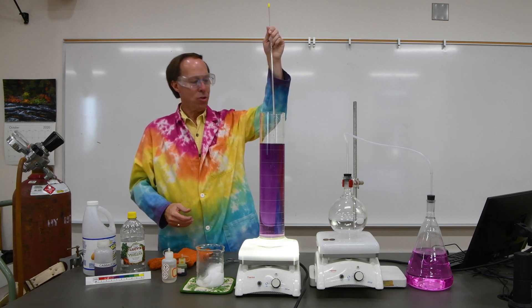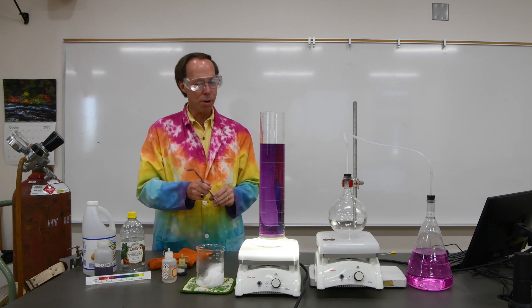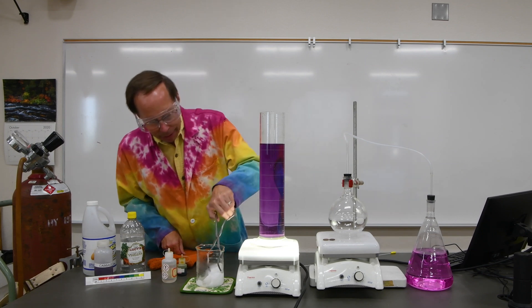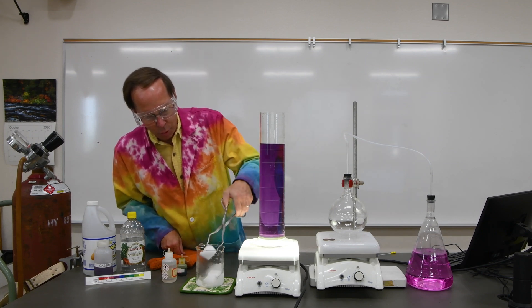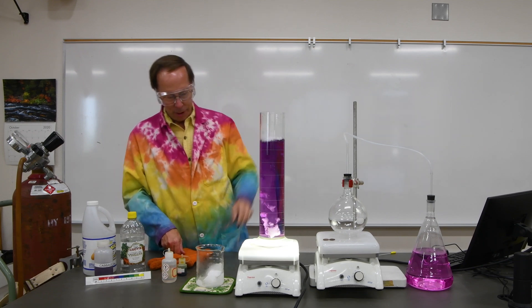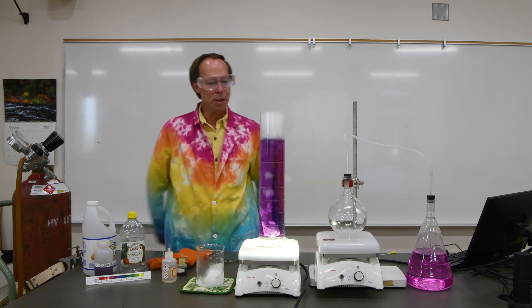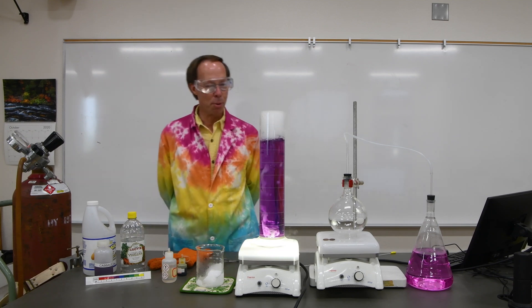Dry ice is simply frozen carbon dioxide. And when carbon dioxide dissolves in water it forms carbonic acid. So let's go ahead and put a piece of dry ice into our container here and watch as the pH slowly drops and the colors begin to change. It starts out with a lovely purple color.